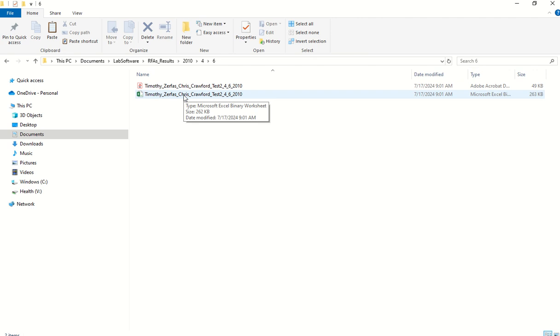Okay, so the result is done. It's been sent to the client. We're good, right? Now, some of you have asked for not automatically sending things to the client. So you can do that now. You get a none for your delivery method. And if I recall correctly, if you select none, it does everything that I just showed you, except the email doesn't go, right? So you'll still get a PDF, right?